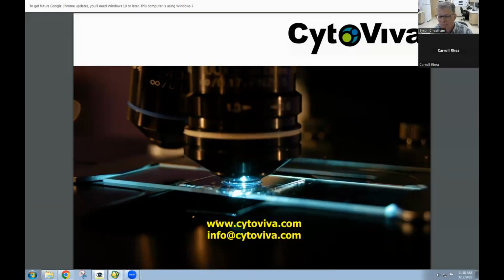But yes, it's possible. Again, sample prep is very critical to having success, as it is with any microscopy technique. Sometimes we find ourselves spending as much time working with customers not on how to image or how to analyze, but on how to do sample prep to get the data they really need. And the organoid could be a case of that, for example.